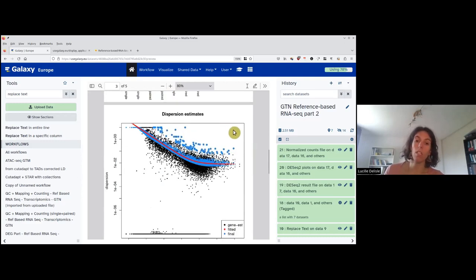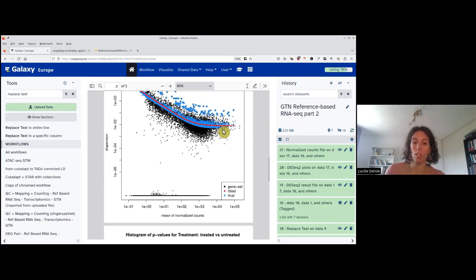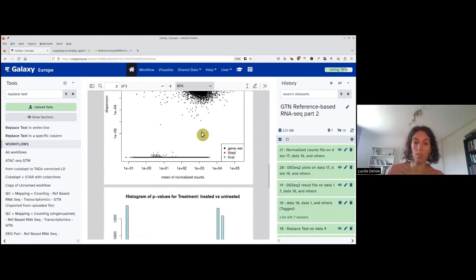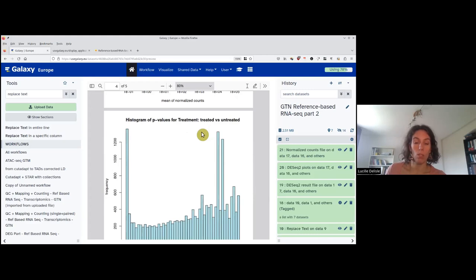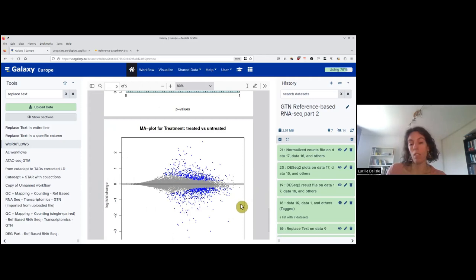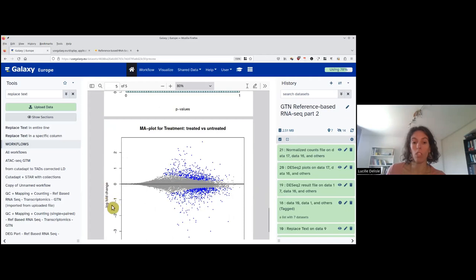Here we have a plot of the dispersion estimates — each dot is a gene showing the dispersion. On the x-axis is the mean normalized counts: right is highly expressed, left is lowly expressed. Here we have the histogram of p-values — left is significant, right is non-significant. Finally, we have an MA plot — mean and fold change. On the x-axis is mean expression (right is highly expressed, left is lowly expressed), and on the y-axis is the log two-fold change. In blue is what is significant.